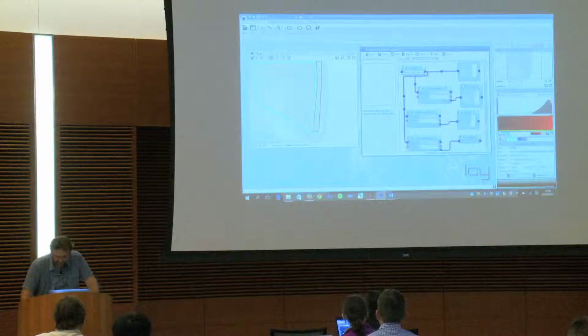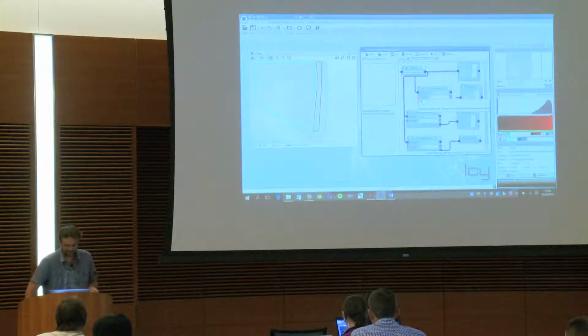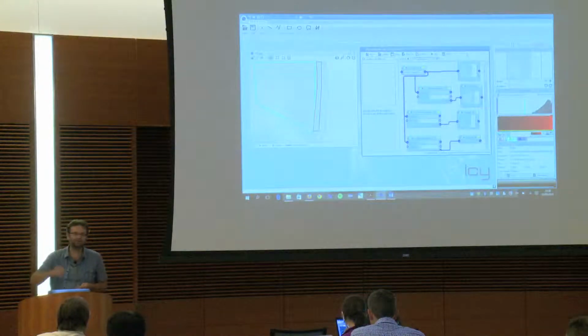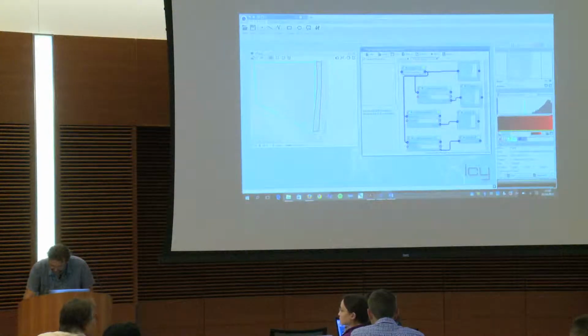And if I want to connect this thing to here, for instance, well, it gave a message, it's not possible. Okay, the variable I cannot connect, but here I can connect. And Stephane will show you a little bit more of the protocol through a complete example. Okay, I'm completely lost with the time, and here it's not a good one.